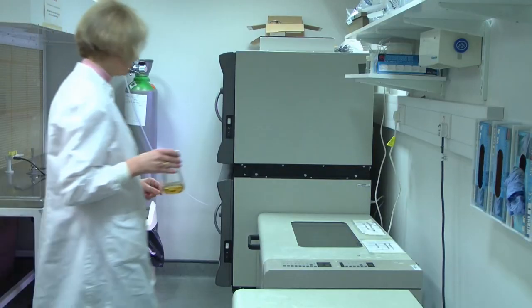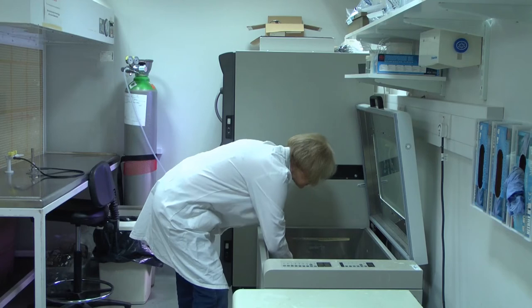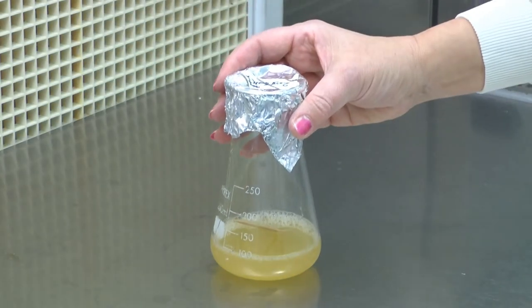The liquid culture is grown overnight in a shaker and the following morning the culture is thick and contains our algal genes ready to be introduced into our camelina plants.